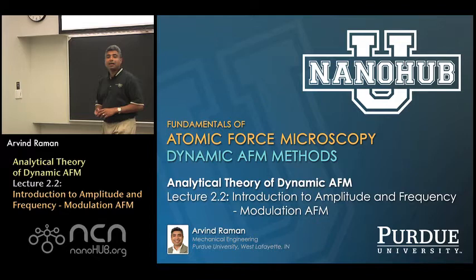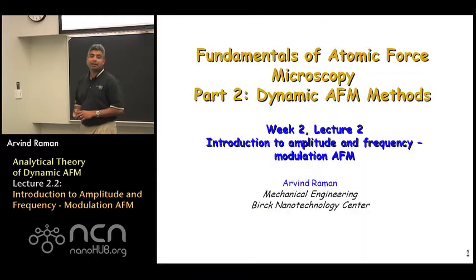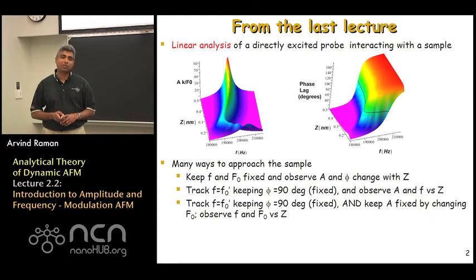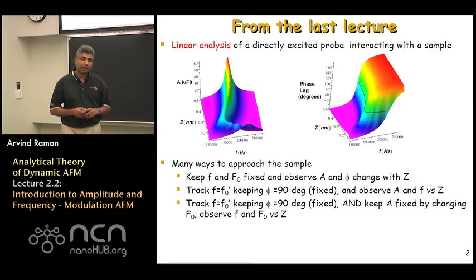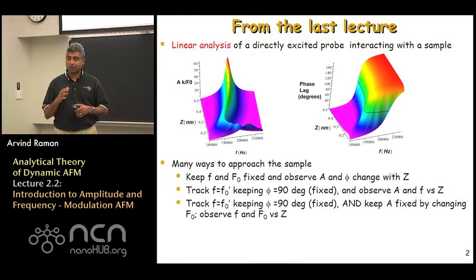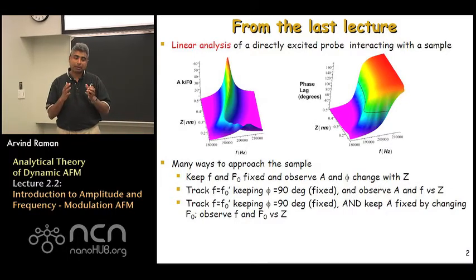nanoHUB-U, online instruction. Hi, and welcome back to Lecture 2, Week 2 of Dynamic Atomic Force Microscopy Methods. In the last class, we had been talking about how the amplitude and phase response of a point mass oscillator model for dynamic atomic force microscopy is influenced by the interaction forces between the tip and the sample.